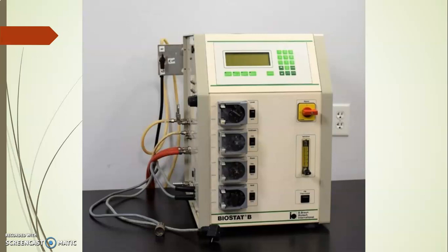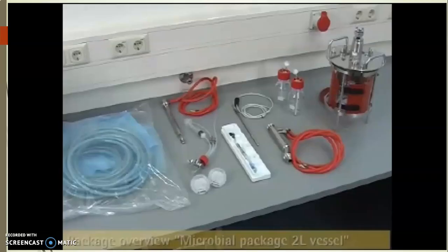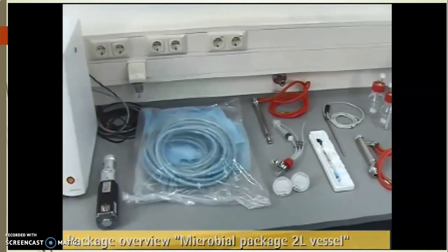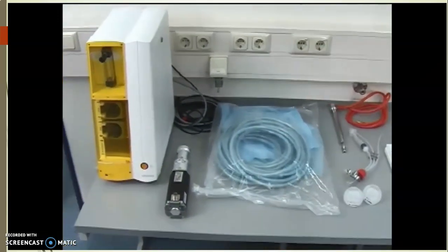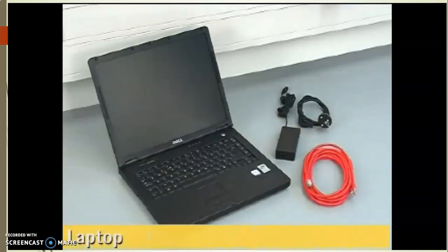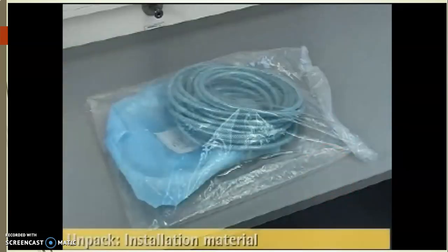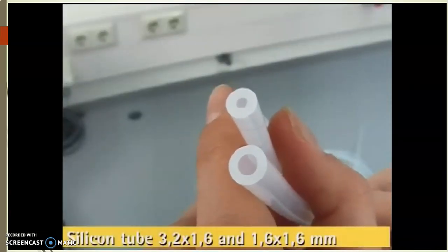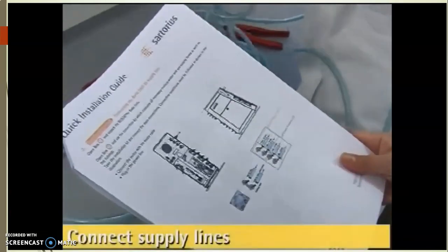Now I am going to present a video on the Biostat bioreactor. The video was collected from online content and integrated here. So this is the video presentation. You can see the microbial package, these are the different parts of the bioreactor, and this is the 2-liter volume. Cooling fingers and laptops are also needed. Then the installation of different tubing materials, silicone tubes of different sizes.